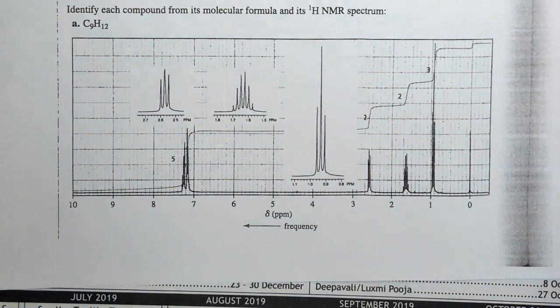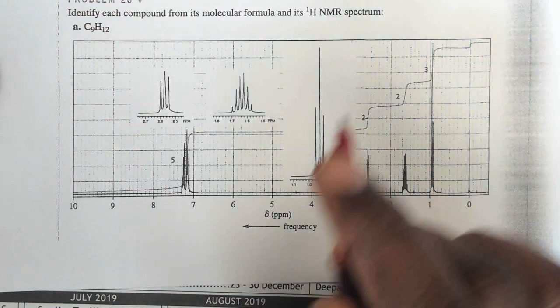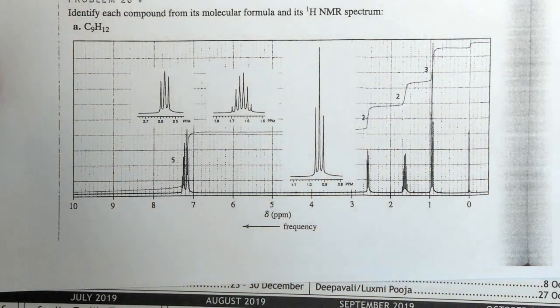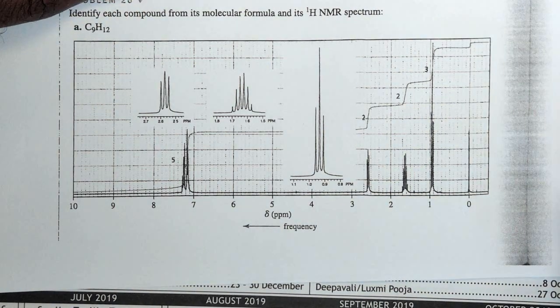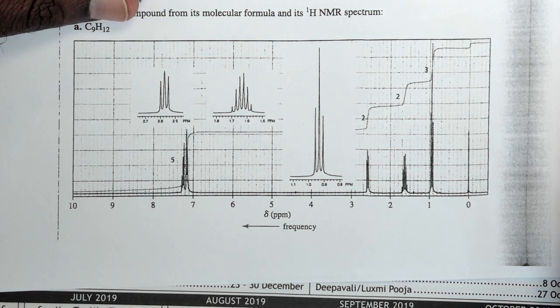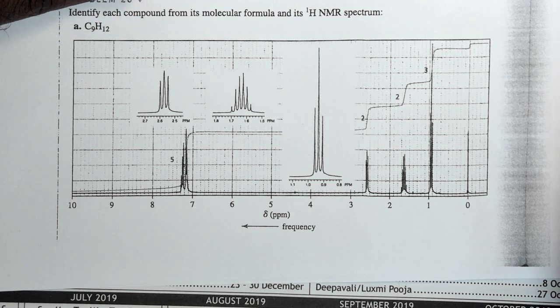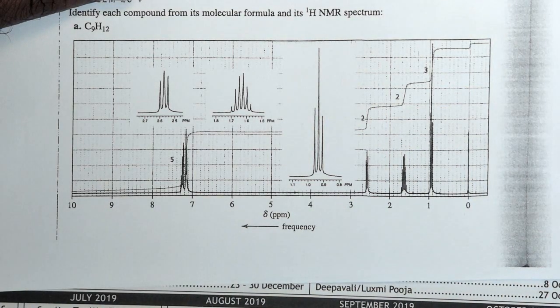Students, today what we're going to do is look at an NMR spectrum and then be able to get a structure from the different resonances in the spectrum. So we're going to look at every resonance in detail, see what information we can get out of them, look to see if we can get the respective groups in the structure identified, and then try to put these different groups of fragments together to make a plausible structure that you think this would represent.